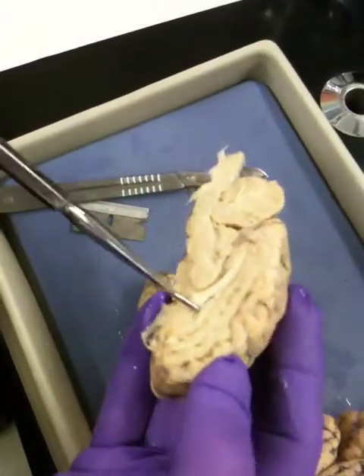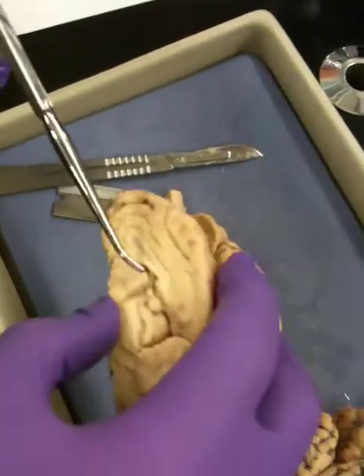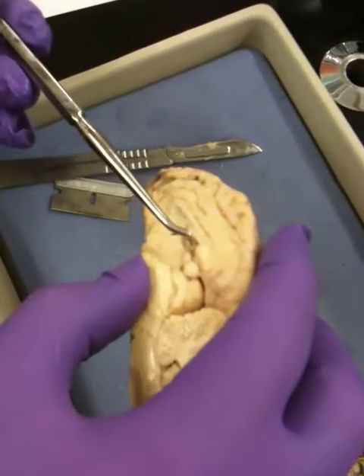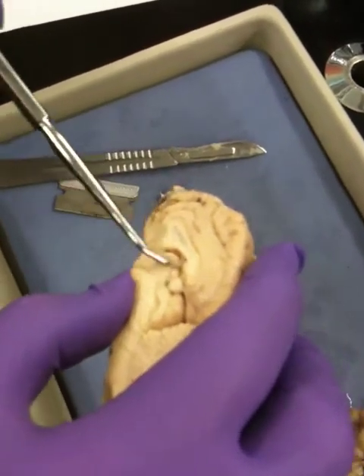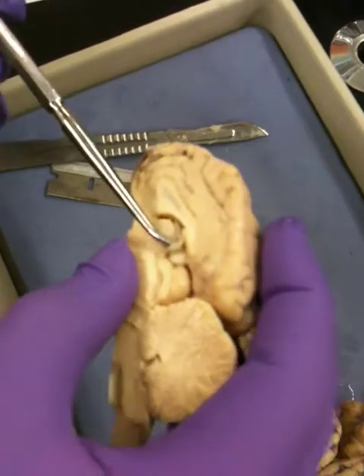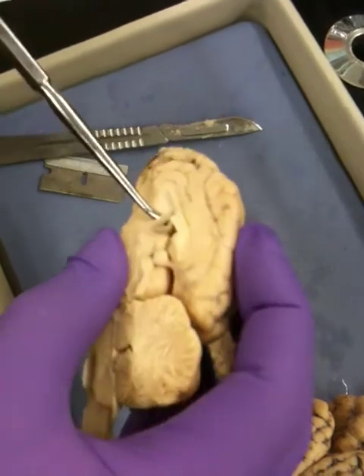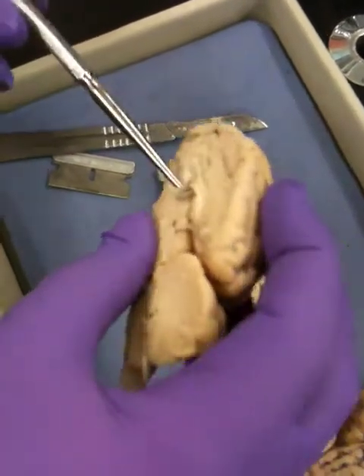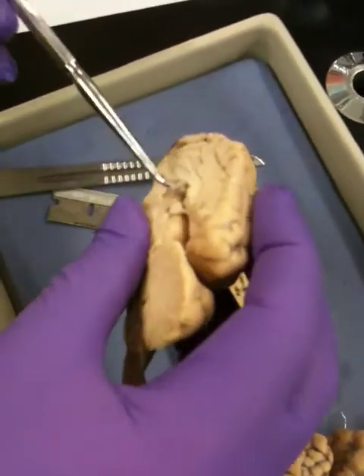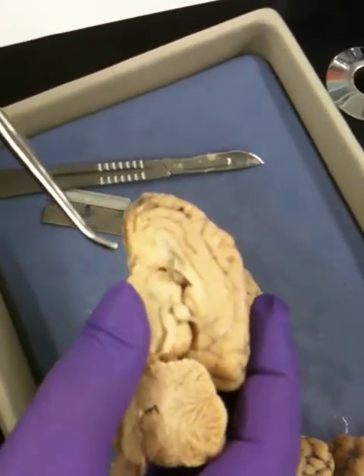Coming down here, there was a little capillary earlier I saw. This is called the choroid plexus. They're specialized capillaries. What do they do? I know you've studied this one. If you studied neural tissue, they're involved in the production of CSF, along with ependymal cells. These are the capillaries, dark colored, hiding in this corner here. I had to go in there and take them out, like a rattlesnake. It's called the choroid plexus. It's not on the sheep brain, but it's on the human brain.